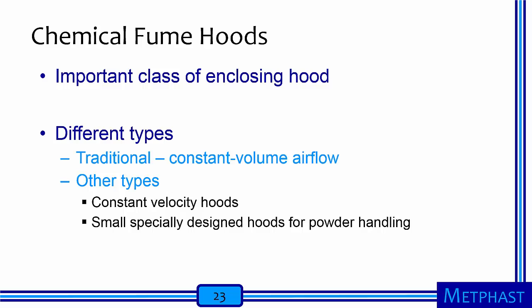Chemical fume hoods are a very important type of enclosing hood, commonly found in industry, research, and academia. There are different types of chemical fume hoods. Traditional fume hoods that use constant volume airflow are the most common. Other types of fume hoods provide constant velocity at the face by variably controlling airflow. Later in this presentation, we will discuss smaller specialty hoods that have become available for powder handling.